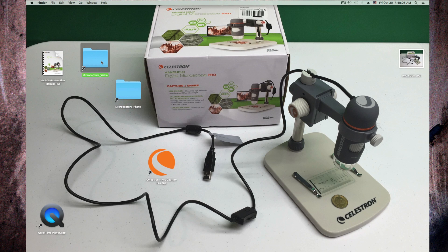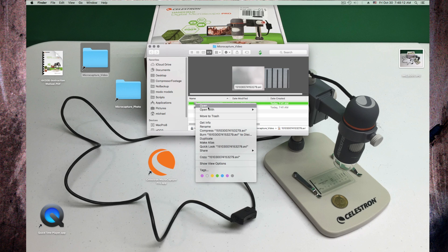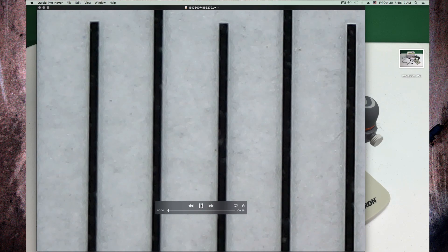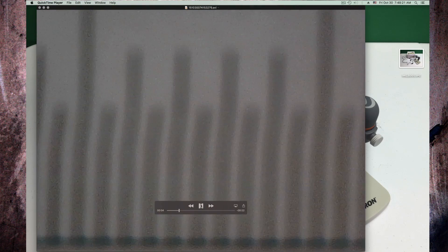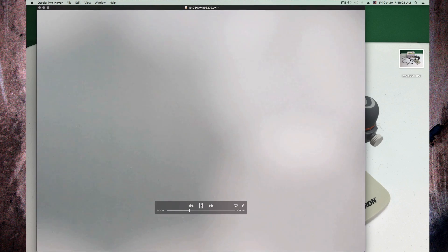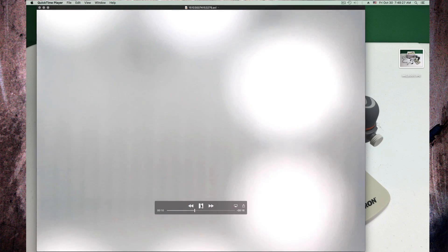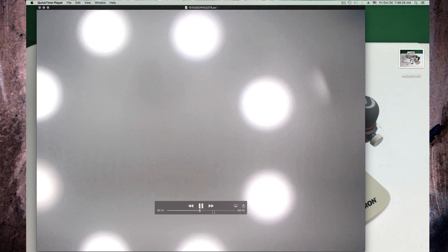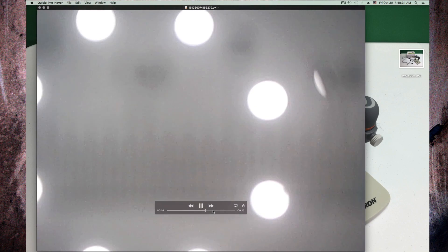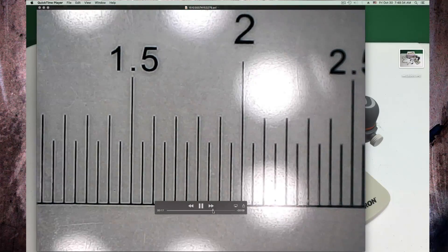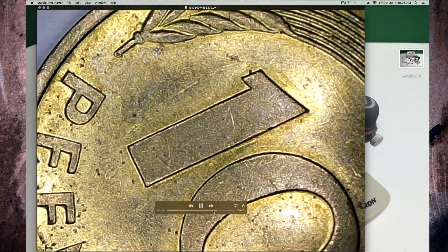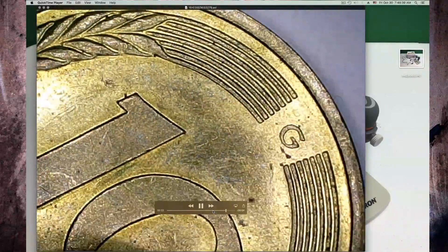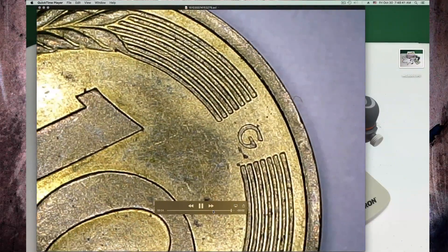And then I have the video folder. So the video taken today here. So that's where I moved around yesterday a little bit. And as I said, the microphone doesn't work on the Mac. I didn't do much here. I was like experimenting with focusing and stuff. But so the video is actually fluent. There is nothing to complain about. So if you have a bug under there or what, that will work great.